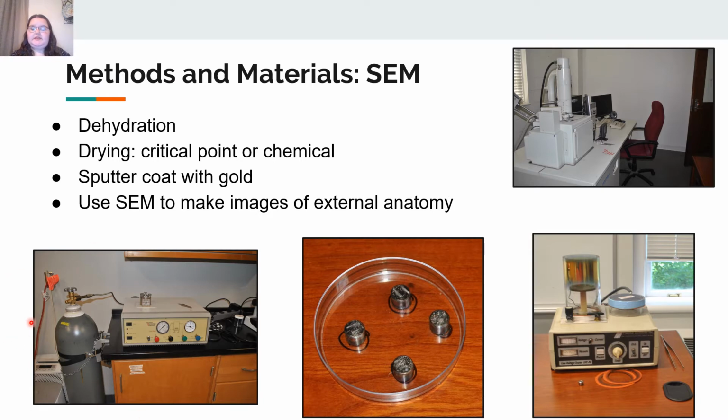And then once these embryos are dried, they're sputter coated with gold so that we can see all of their external features, and this gold reacts with the scanning electron microscope, and then you're able to see detailed images of the embryos in their external anatomy.